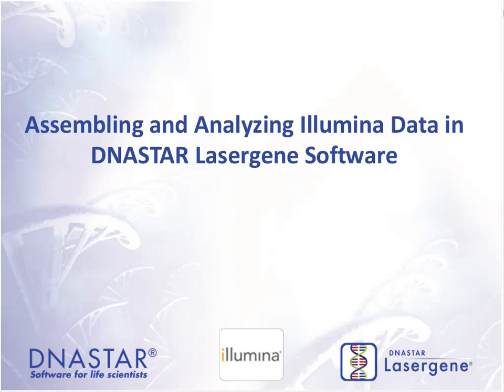Matthew? Thank you, Raymond. So Raymond listed a lot of different workflows that our software can support with Illumina data. Today I'd like to show you a couple of those workflows. We'll start with an introduction with some PowerPoint slides, and then I'd like to move over to my desktop and we will look at some live software demonstration.